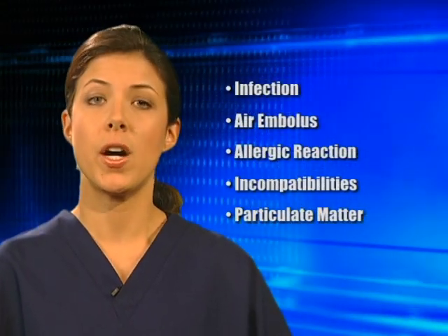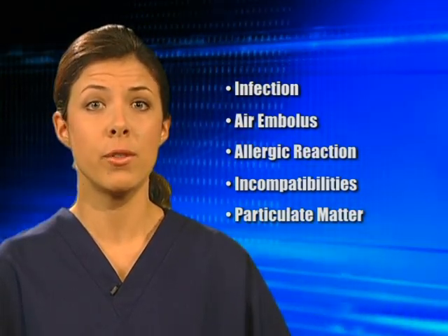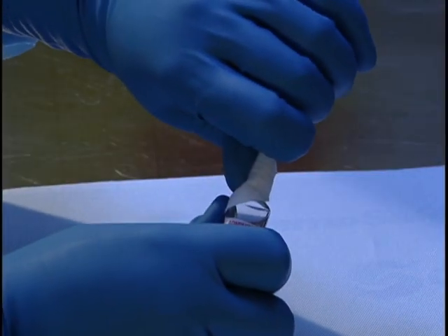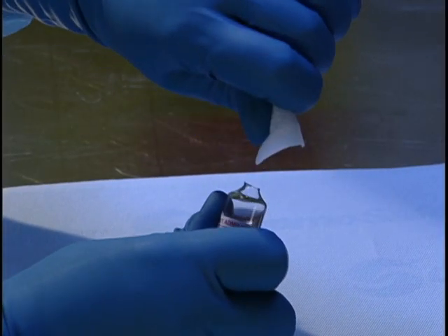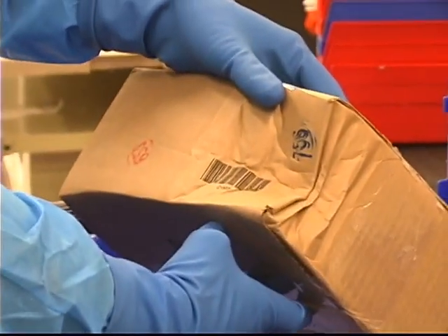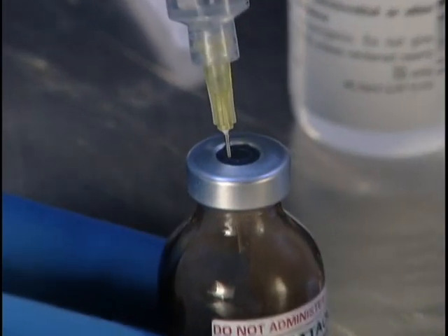Particulate matter refers to unwanted particles present in parenteral preparations that can cause adverse effects to the patient if injected into the bloodstream. Some examples of particulate matter are microscopic glass fragments, hair, lint or cotton fibers, cardboard fragments, undissolved drug particles, and fragments of rubber stoppers.